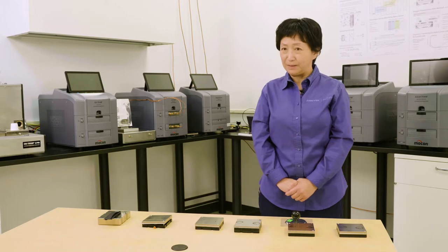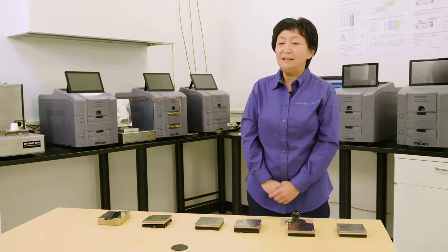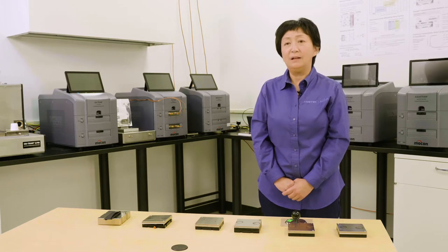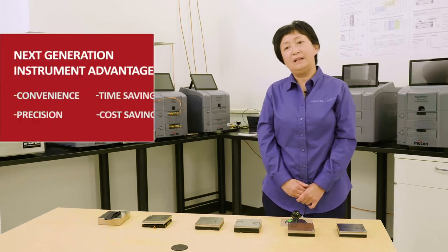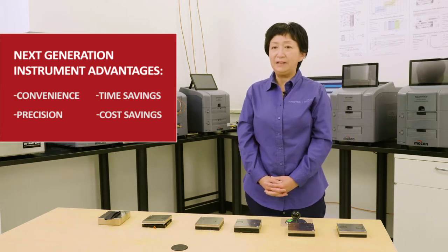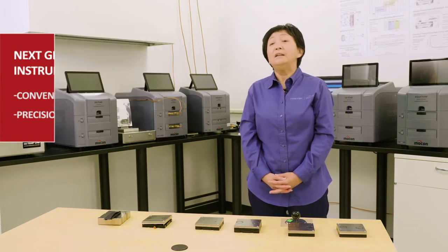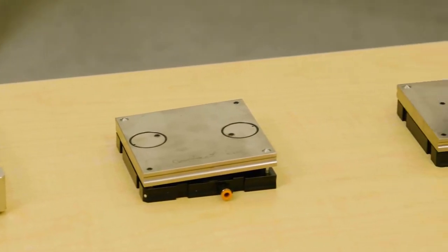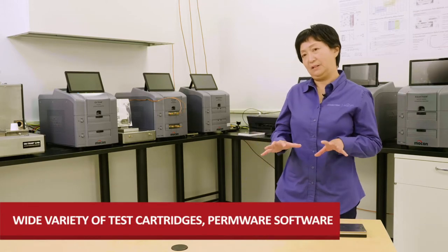Hi, I'm Georgia Gu at EMATOC MoCon and I'm the senior global application specialist. Today I'm going to review the advantages of our next-generation instrument for permeation. All MoCon's next-generation analyzers share the advantages of convenience, time savings, precision, and cost savings. In addition, there is a wide variety of test cartridges for different applications and we have a newly designed software called Permware. Those are the focus I'm going to talk about today.